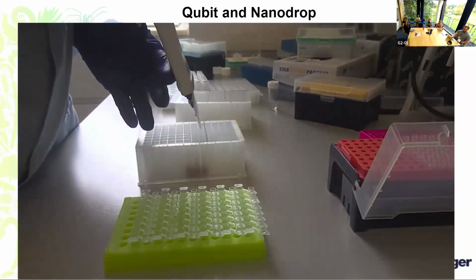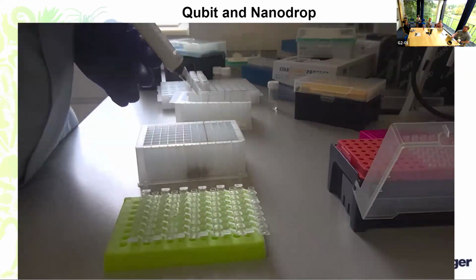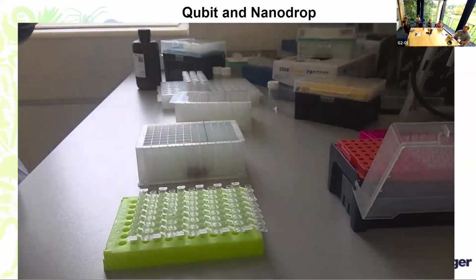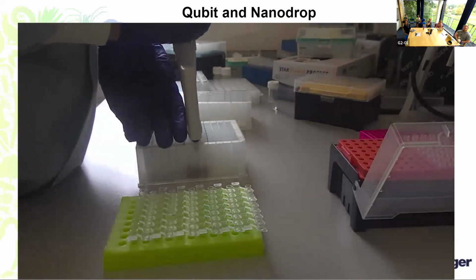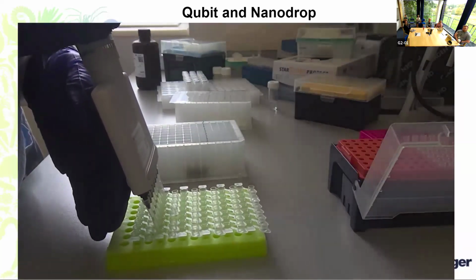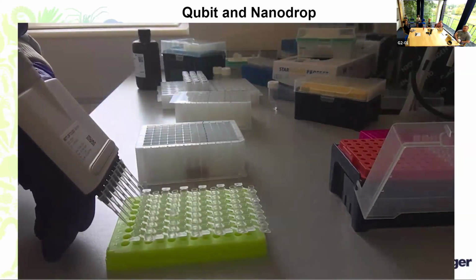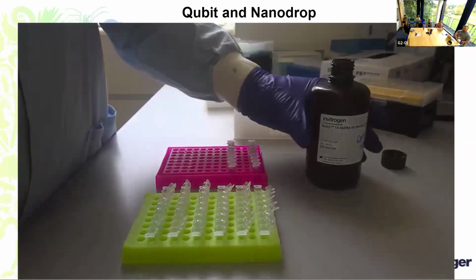And then we add 1 microliter of our DNA to each of the sample tubes before adding the buffer and dye mixture to each of the samples. So the Qubit buffer has a dye in it which attaches to the high molecular weight or double-stranded DNA, and that, through fluorescence, will tell us how much DNA we have per microliter of sample.